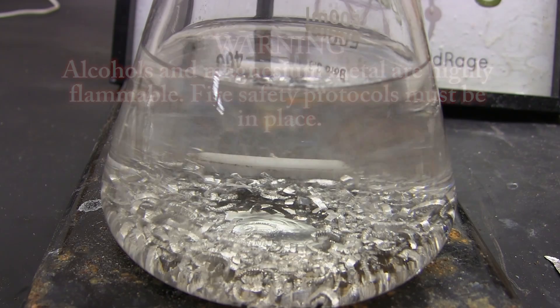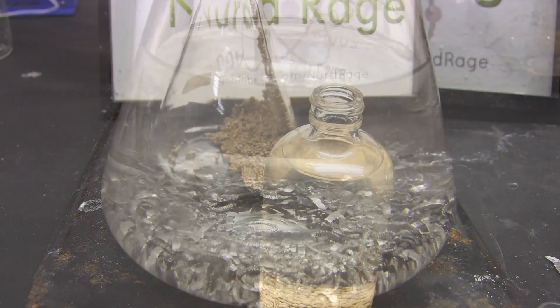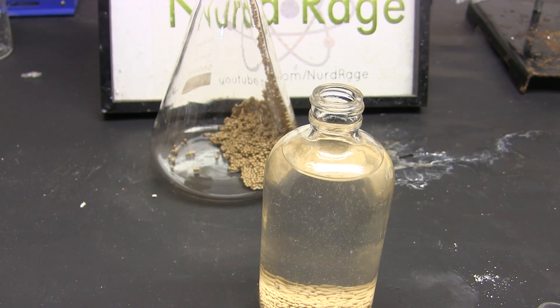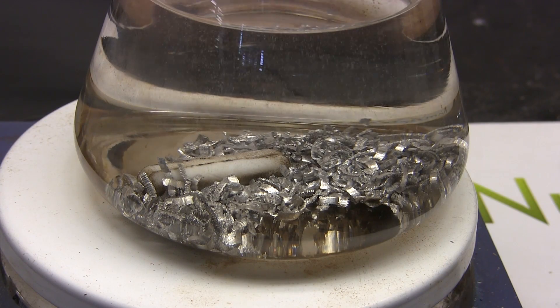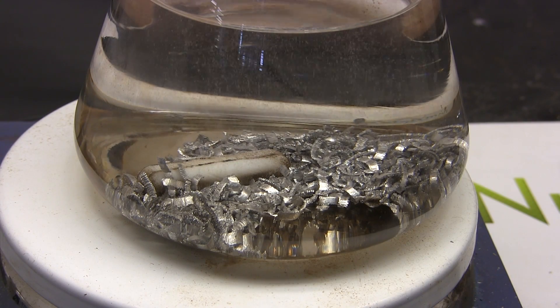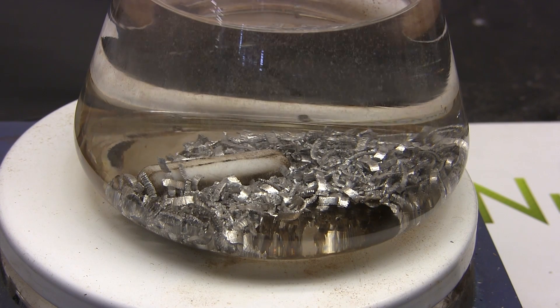Greetings fellow nerds. In this video we'll dry some organic solvents using magnesium metal and molecular sieves. Before we begin we must first explain what we mean by drying solvents — we don't mean drying as in evaporating them. When chemists say they want a dry solvent, what they really mean is they want a water-free or anhydrous solvent.